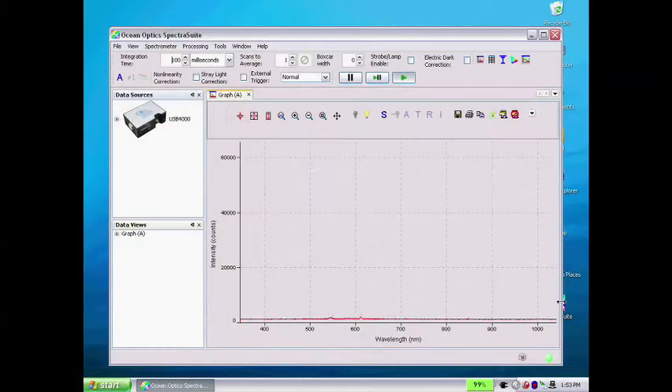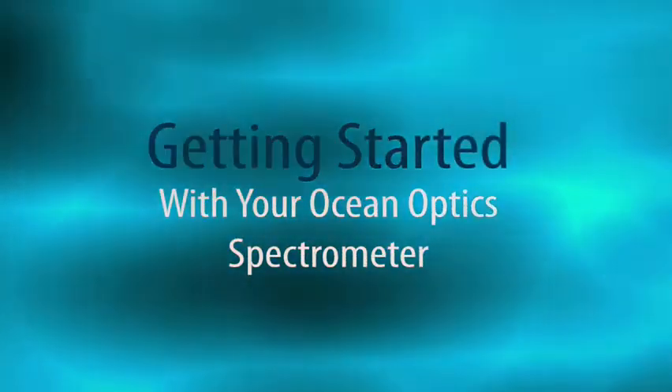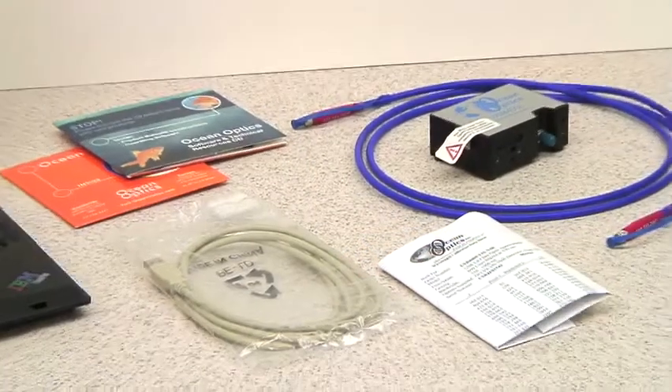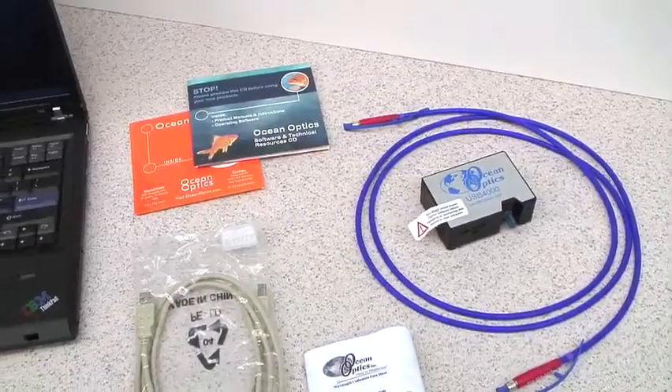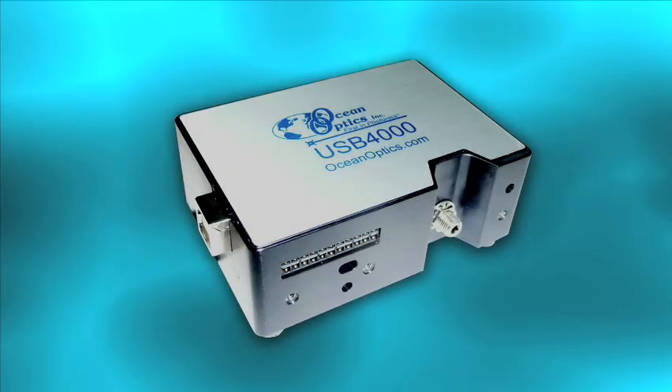Let's start out with what comes in the package. Your Ocean Optics Spectrometer comes with several standard items, plus any accessories you've ordered and power supplies where applicable. Use your packing list as a handy reference. First, your new Spectrometer. For this demonstration, we'll be using the Ocean Optics USB 4000.